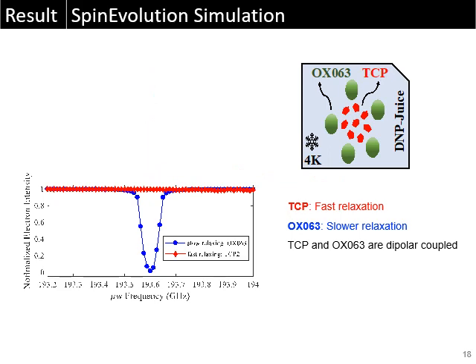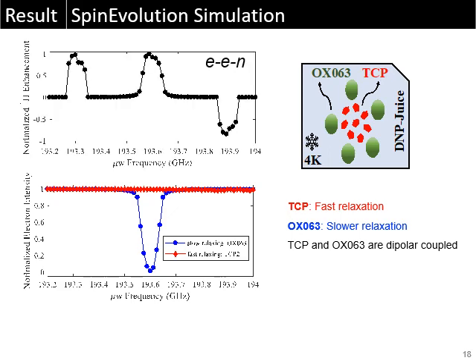And then we took this system and cut out the Hamiltonian for EN cross relaxation to make sure that the Overhauser effect doesn't exist in this case. And then we are able to simulate a frequency profile very similar to what we observed experimentally.